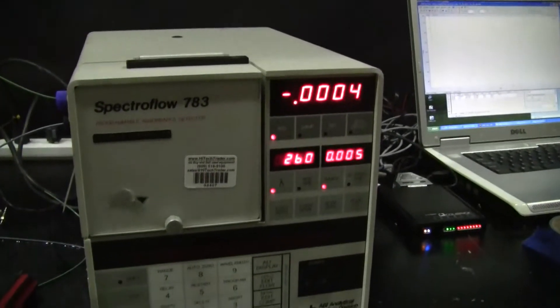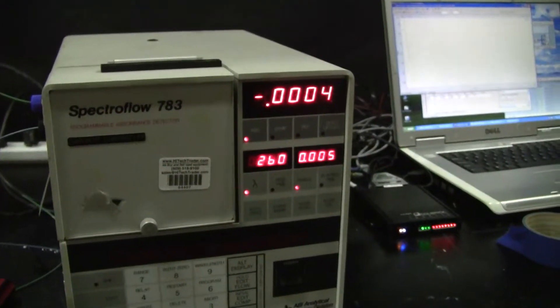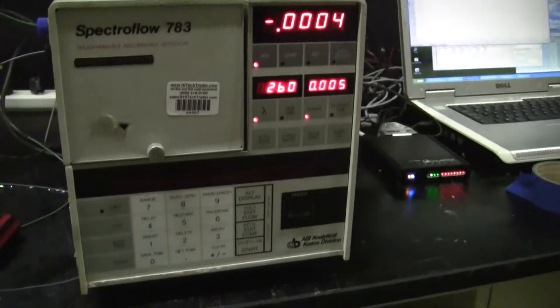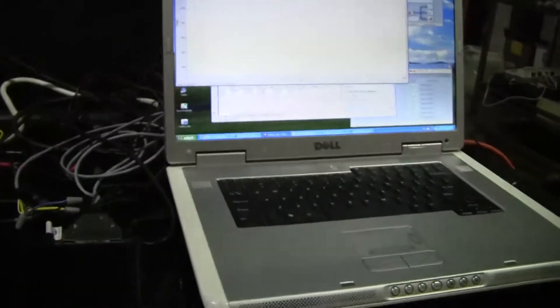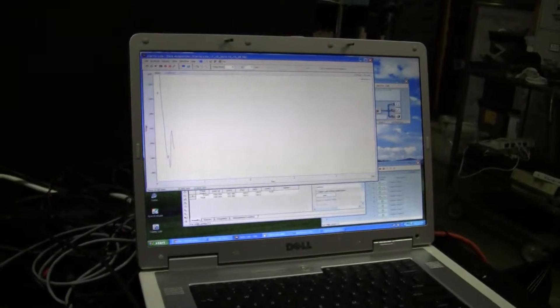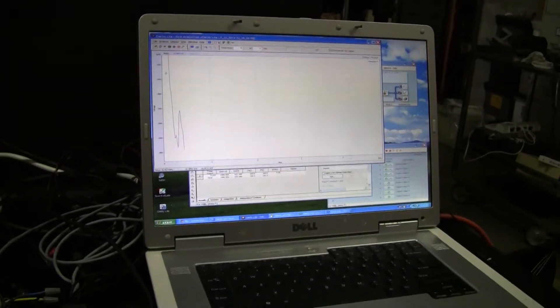We have the wavelength set at 260 nanometers. We're using a program called Clarity Light. It has an 80D conversion. It's going to generate a signal for us.